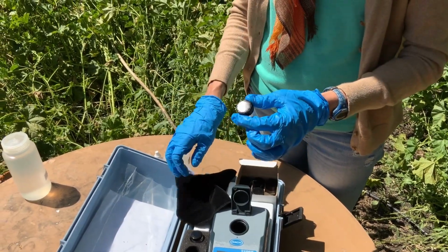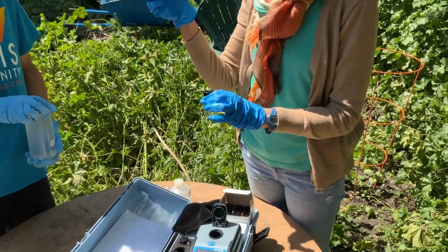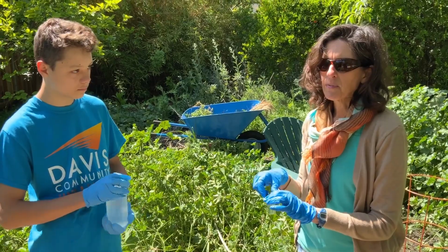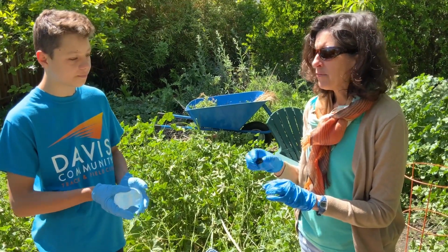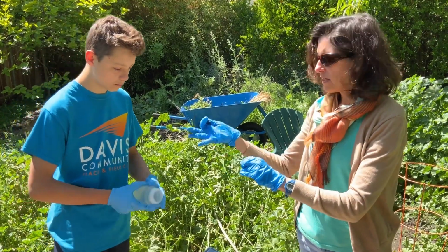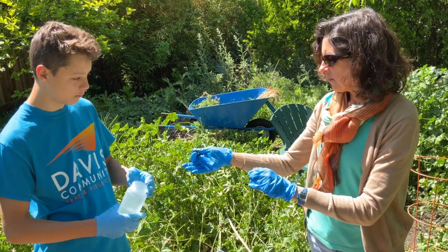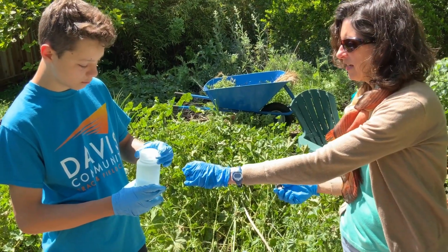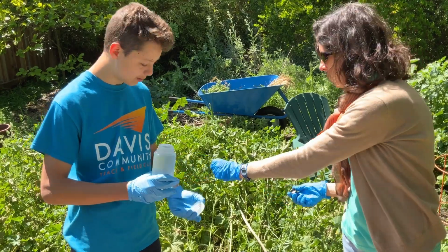All right. So Eli, oh wait, I forgot to say, he inverted it. Give it a few more, because if you invert it, you have to do it right before you're ready to put it in. Right, okay. I was too slow for you. If you don't do that, then the suspended solids can settle. All right, let's go for it. So pretty quickly, so that it doesn't all settle.